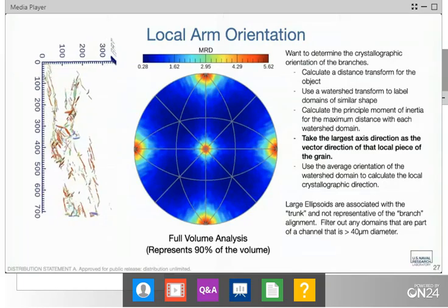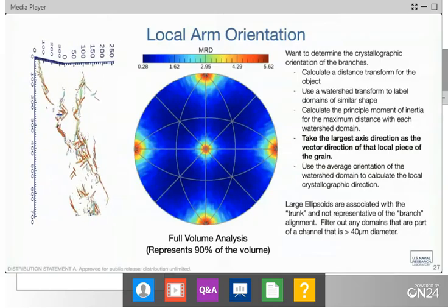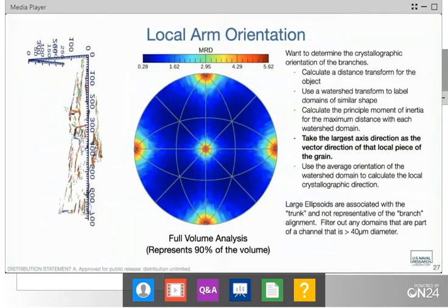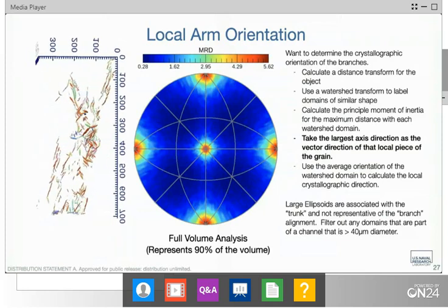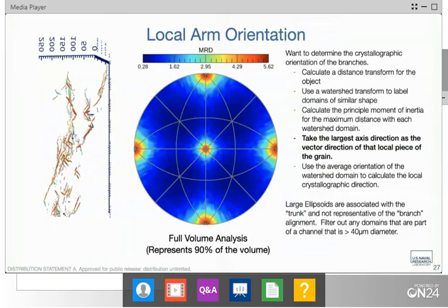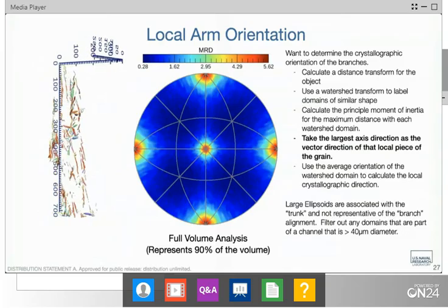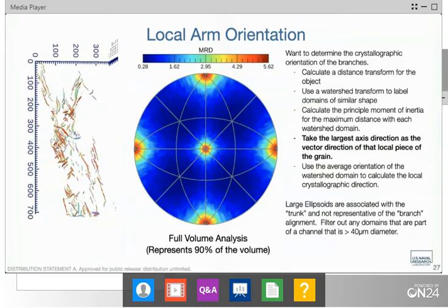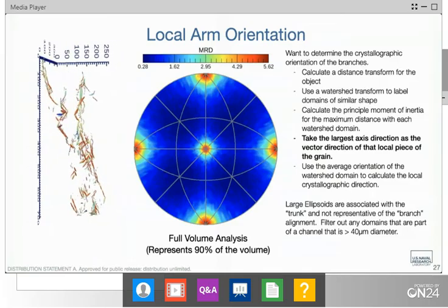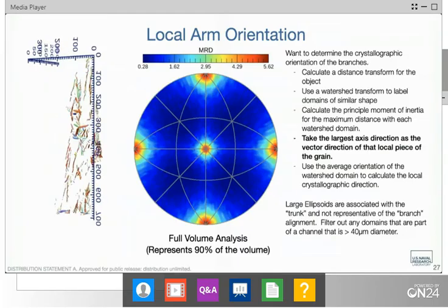What's interesting, and I think what this slide is showing, is that even though that's happening on the sub-micron scale, we're seeing it reflected in the more mesoscale microstructure as well. Those clusters of cells still add up to a fairly textured, morphologically textured sample. So I think there's still a lot of work to be done in figuring out exactly that relationship, but your results and what I'm seeing are very consistent with each other.